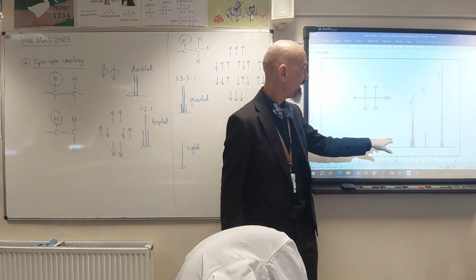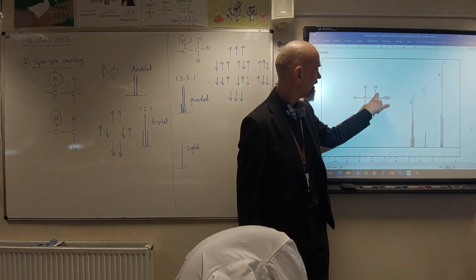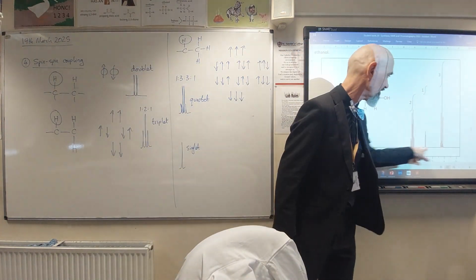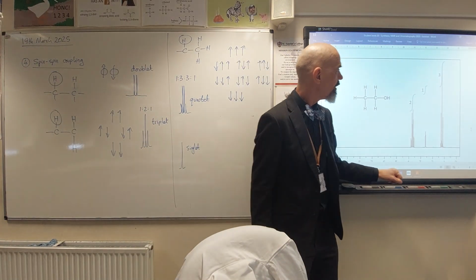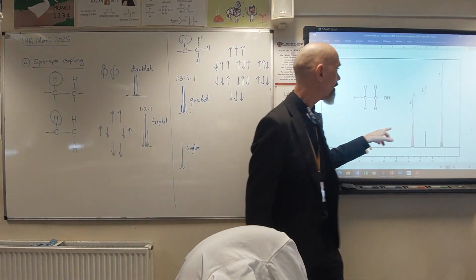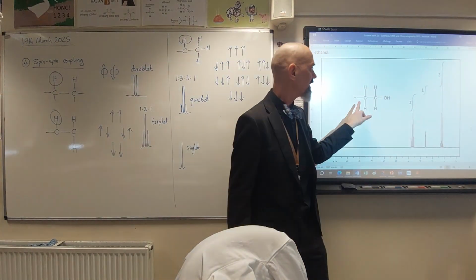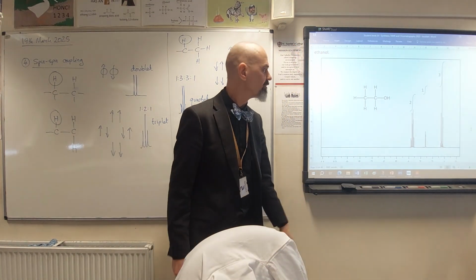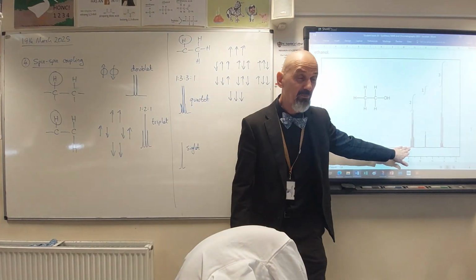The chemical shifts show us that one of the peaks is shifted further to the left. That's the CH2 though, because it's next to the oxygen. The OH, as I said, can be tricky and can actually appear anywhere around here. But that's the OH peak down there. When I do the integration trace, I get a 3:2:1 ratio, where the 3, the methyl group, is hardly shifted at all because it's as far from the O as possible. The CH2 is shifted a lot more, and the OH, well, you'd expect the H to be shifted, but weird happens.